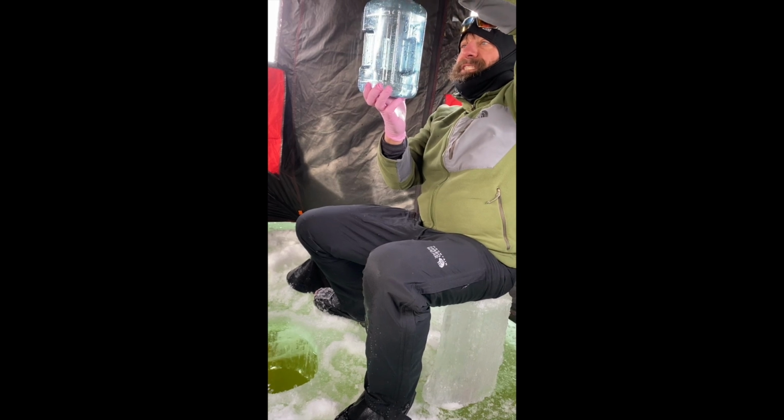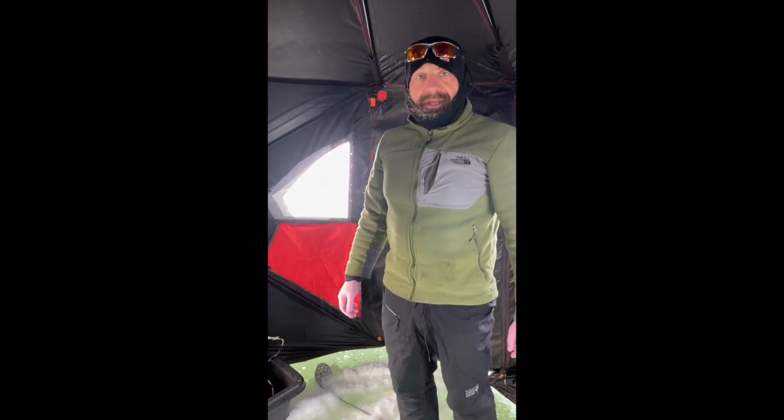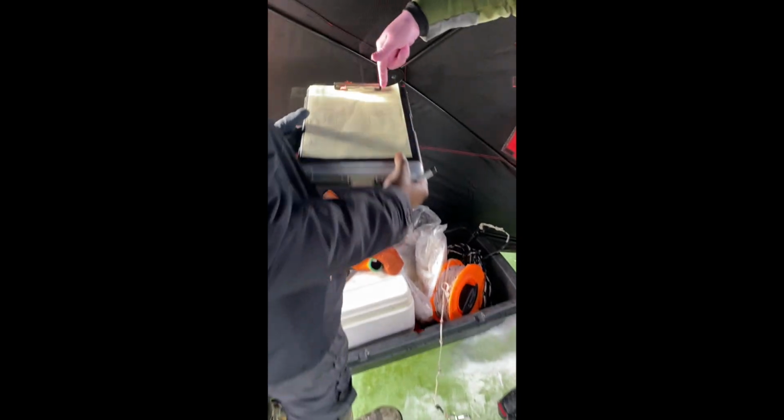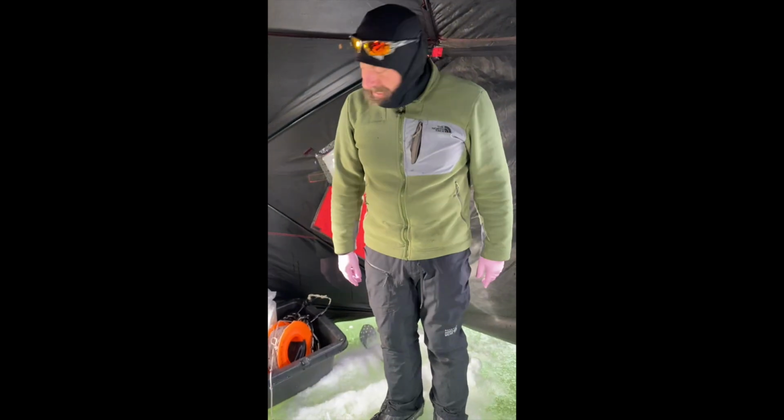It's kind of neat because you can see a ton, maybe you can't see it here, but there's a ton of big, happy looking Daphnia and big copepods swimming in there. But we'll get a closer look at what's in here once we collect our zooplankton too. Okay, so we finished doing our water. We recorded the volume that we collected, 8 liters, and the depths that we collected our samples from. If there are any particular notes that you want to make, there's a space to make any water sample notes. For example, bottom water smells weird or something like this, which often happens in this lake in the summer.